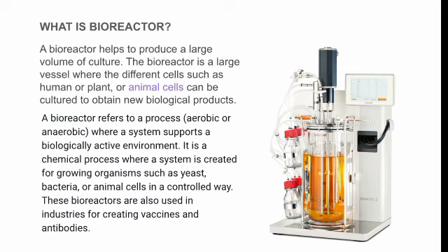It is a chemical process where a system is created for growing organisms such as yeast, bacteria or animal cells in a controlled way. These bioreactors are used in industries for creating vaccines and antibodies.